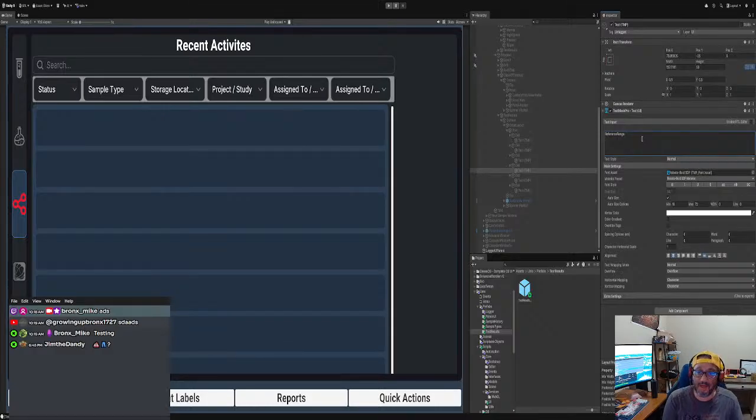So, depending on what organization you're working for, you're gonna have different criteria, right? But the best thing to do is make it dynamic, right? Like if you write a script and you know your columns, you could derive the columns from that script when you get it, and then you dynamically make the columns.